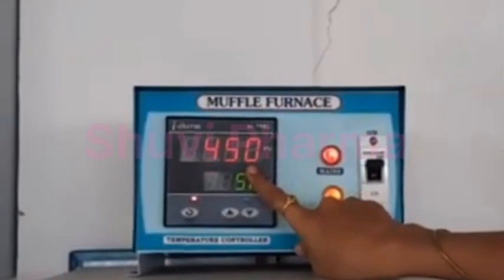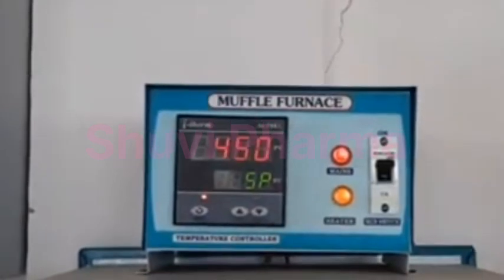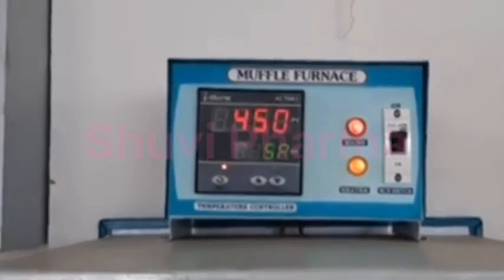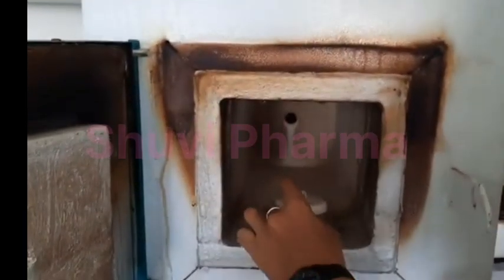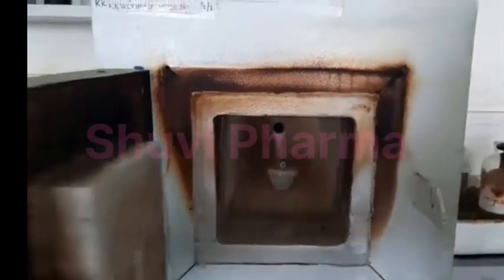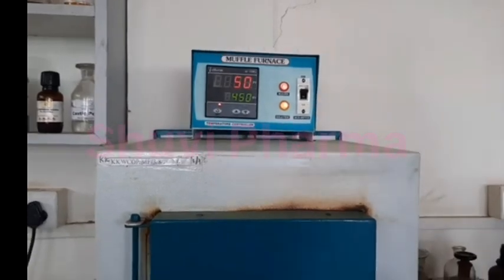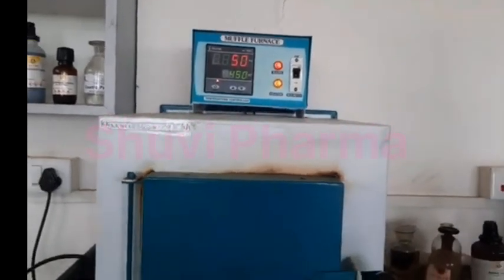The temperature is already set, that is 450. Now we will insert our crucible into this chamber. We will close the chamber and the heating is started.